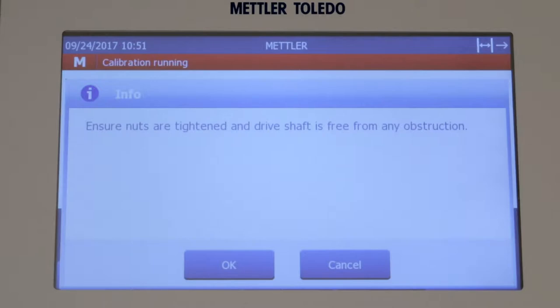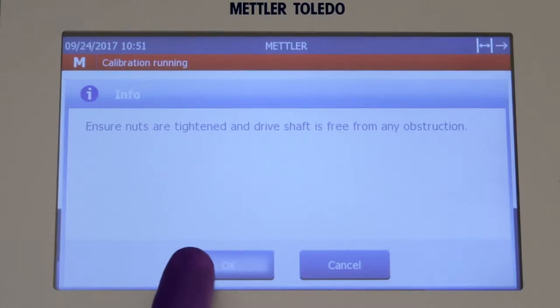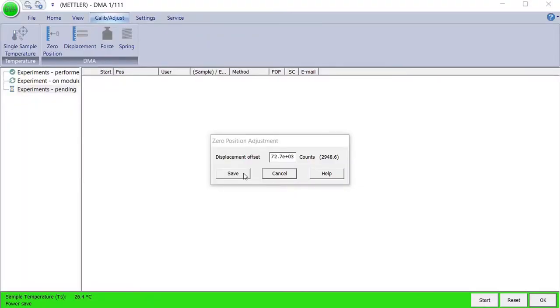Check that all the nuts are tightened and the drive shaft is free from any obstructions. Tap OK to confirm. The newly calculated displacement offset parameter appears in the Zero Position Adjustment dialog box in the module control window. The value of the previous calculation is included in brackets.